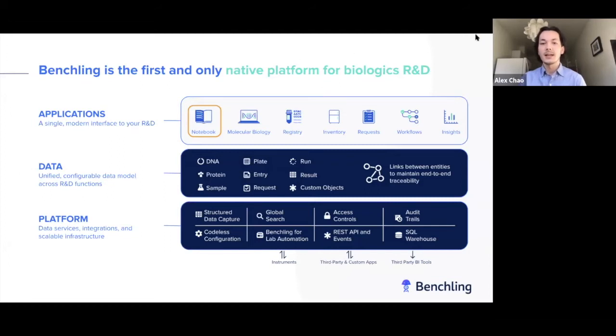Wonderful. So we're going to dive right into the Benchling platform. Again, when we talk about Benchling, Benchling is based off of these 7 applications. And again, our first Benchling Bootcamp series is based around the notebook application. And I'm sure, as you'll remember from our Benchling Notebook basic session, we discussed how the notebook is really a central source of truth within Benchling. It is highly integrated with the other applications on our platform. And importantly, it's a place for you to utilize notebook entries as both observational records and also as experimental protocols.